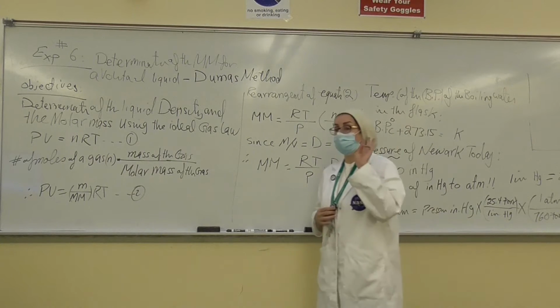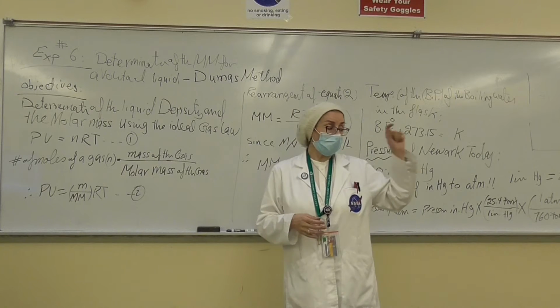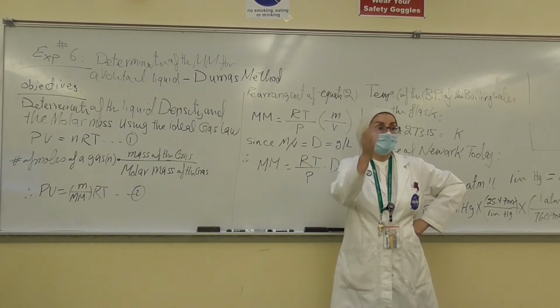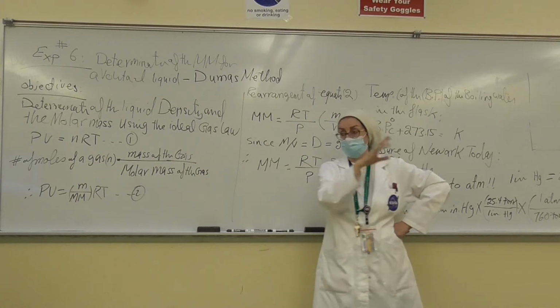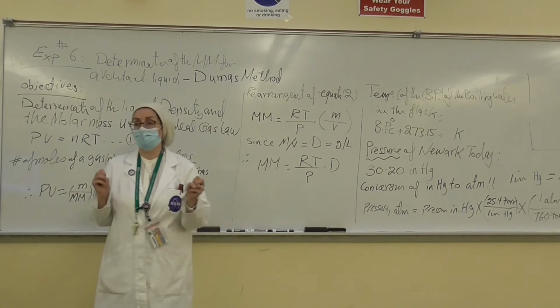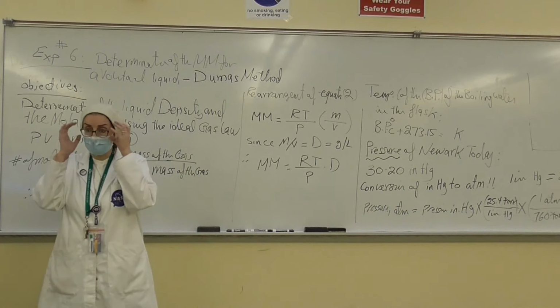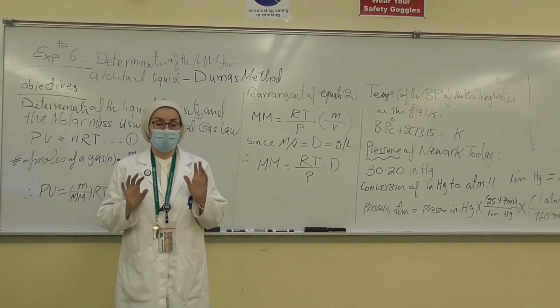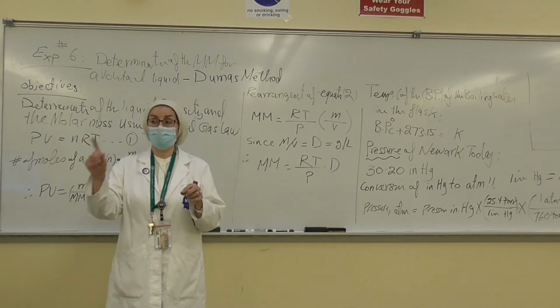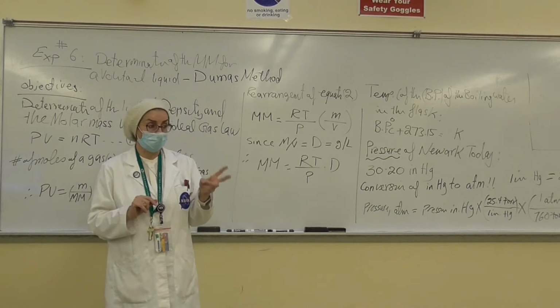We have three unknowns: A, B, and C. At the top of the data sheet, it's asking you to identify the code of your unknown. Whatever you pick under the hood, as we always have them, those chemicals are volatile. Be careful. Hopefully we are all wearing our masks, but we also need to have our goggles on all the time. Then you're going to pick one, and you stick to it because we need to have it for more than one trial.